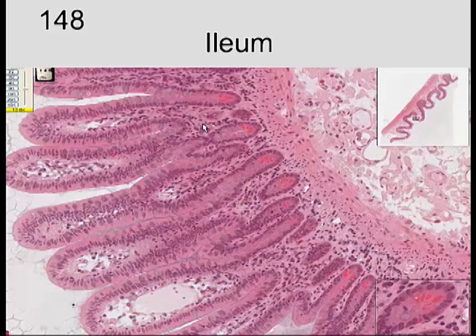Slide 148, the ileum, at a little closer magnification, we can see these intestinal absorptive cells and the goblet cells. We can see the nuclei of these cells kind of lined up. So these are simple columnar cells. We can see them right here. There are nuclei, and there is a brush border that we see associated with the luminal surface. Nuclei, cytoplasm, columnar cells, connective tissue, muscle layer in through there, and more connective tissue, as we see.